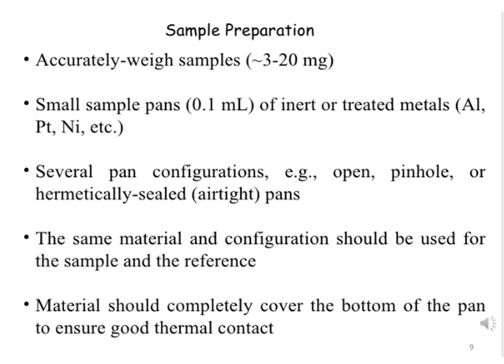When we are going to analyze any sample, the main and important step is sample preparation. We already discussed that the main advantage of DSC is that we don't need to prepare the sample a lot; no great effort is needed.